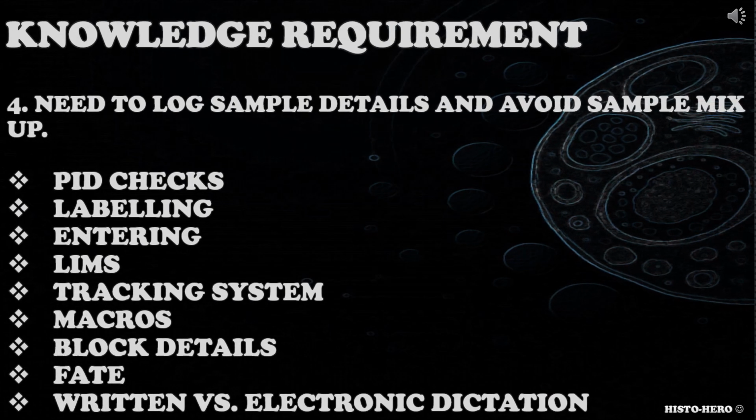The fourth knowledge requirement is need to log sample details and avoid sample mix-up. Candidates should know about the need to log sample details and how to avoid sample mix-up. You could ask them to explain how they would log sample details in your lab, why it is important to log them, and what would happen if there was a sample mix-up. You could ask them to explain how they would deal with a mix-up of specimens.